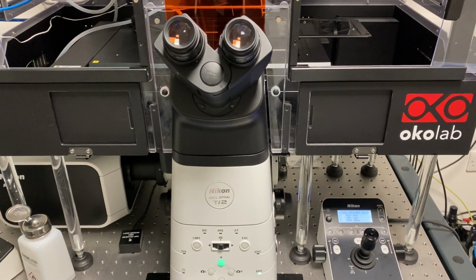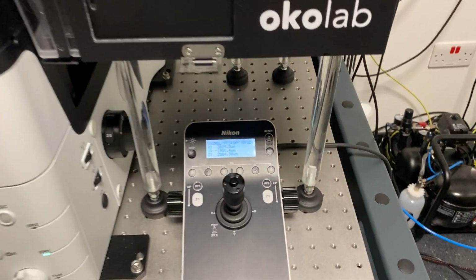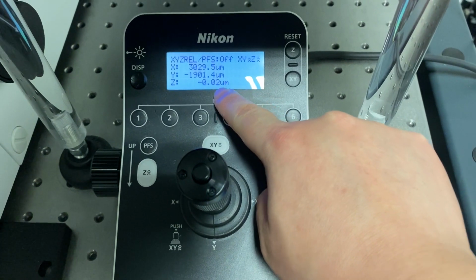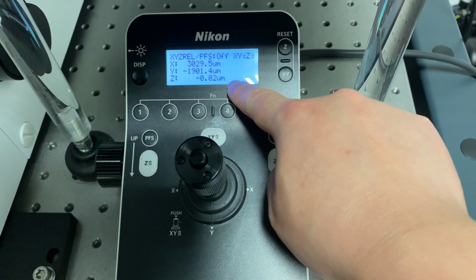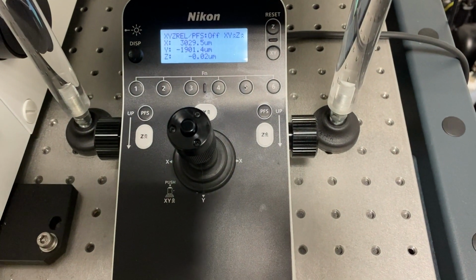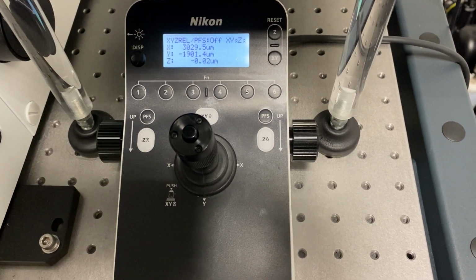Now I'm going to demonstrate how to switch from the 20x lens to the 60x lens. First, you want to reset your Z number. Press this button here. So your Z is now 0. This doesn't change the actual height of your lens, but this 0 number becomes a safety guide for you. So no matter which lens you're going to use next, your focal plane should be somewhere around 0.